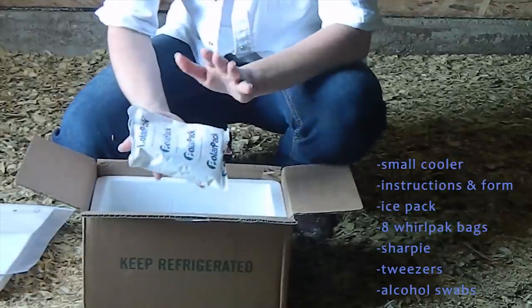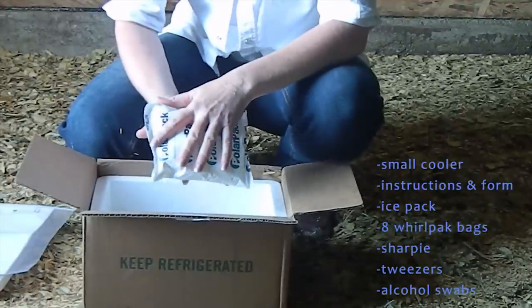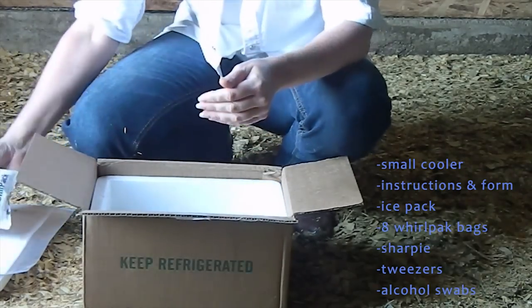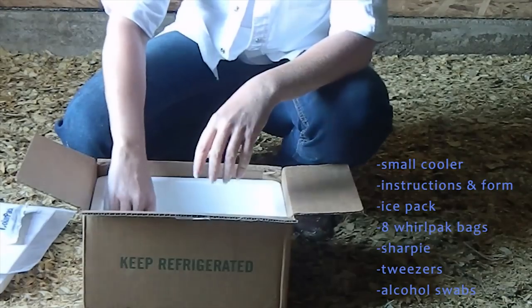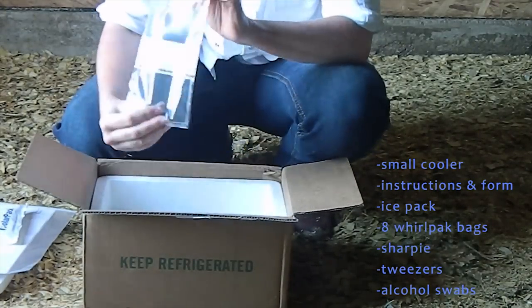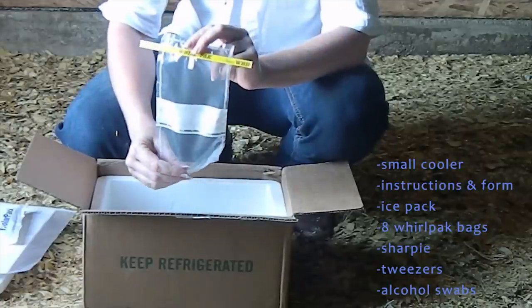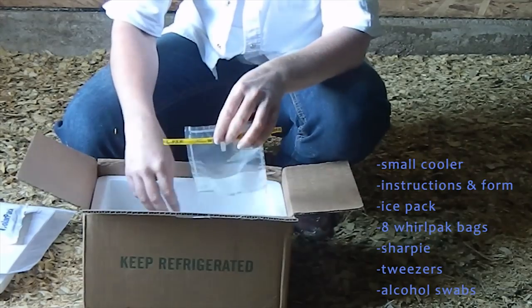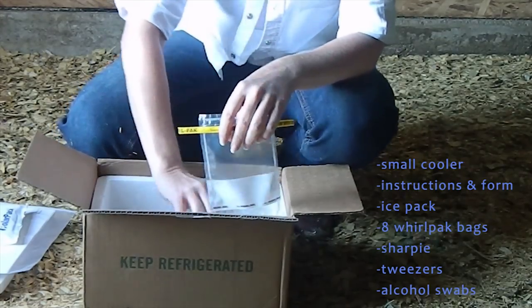It's going to have an ice pack in it. When you get it, put the ice pack in the freezer so that when you're ready to ship the sample back to us, your ice pack is ready as well. It's going to have eight foil pack bags so that you can take drip samples out of the water lines themselves, or you can take samples from your source such as your well or the taps at the end of the houses.